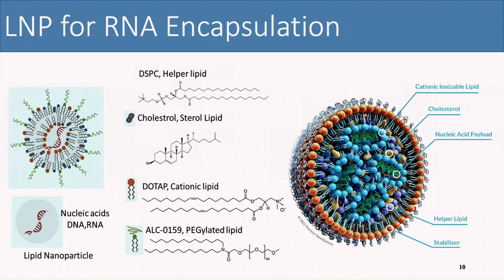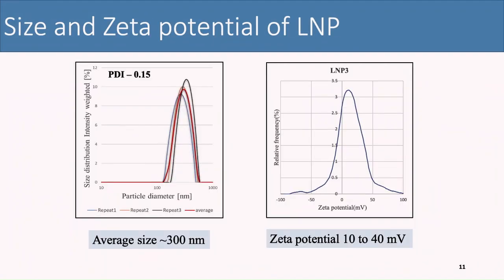For the encapsulation, we used an RNA that we got from yeast. This was not a single length; it had a wide distribution. These are very initial experiments to see whether it works or not. When he produced the lipid nanoparticles, these are not liposomes, these are lipid nanoparticles, the sizes were large, as we expected. So we need to optimize the size of these lipids.